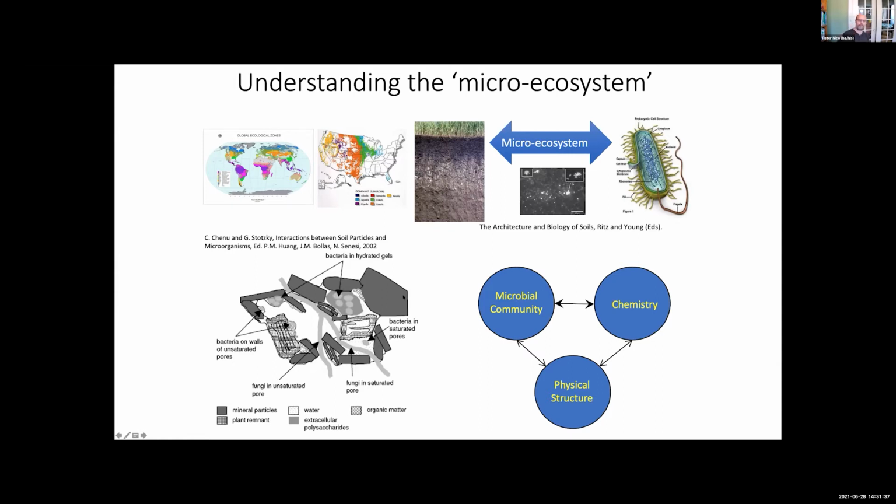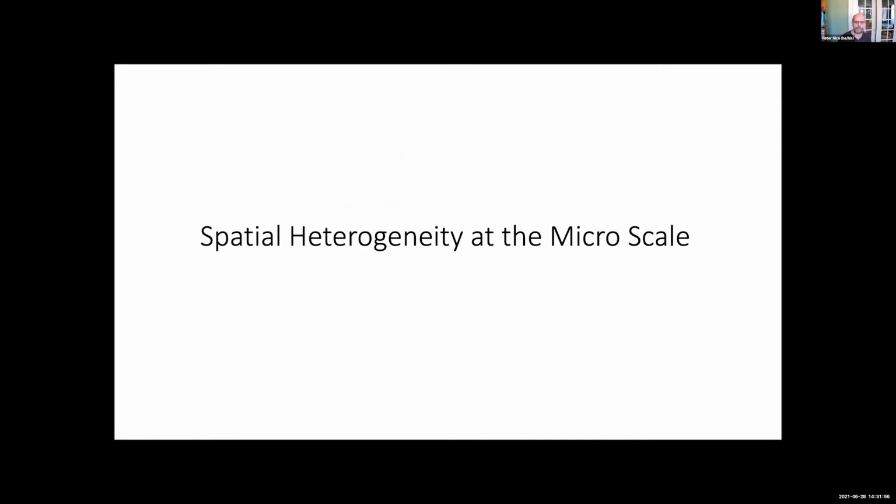And there's still much fundamental opportunity to understand exactly how these processes work. What I'm going to show today is just a series of vignettes of different ways that we've used STXM to try to understand some of the carbon cycling at this micro ecosystem scale.